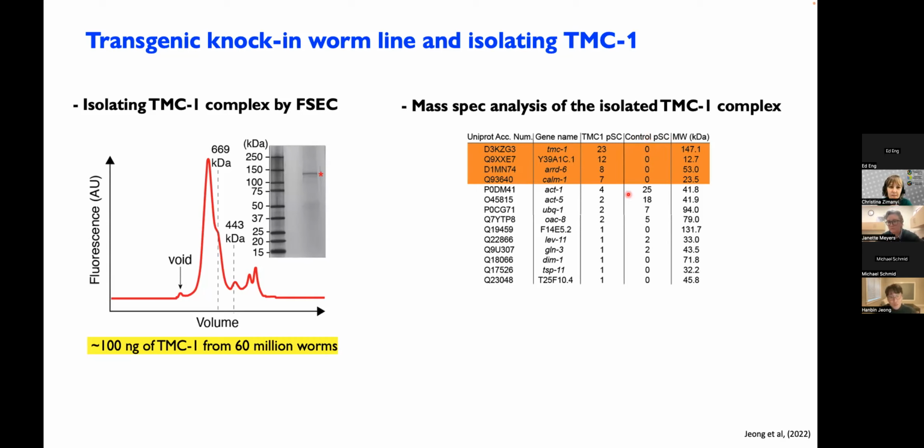And I just compare the TMC1 and the negative control. And as you can see, TMC1 and other proteins hit, but the negative control is just 0 here.